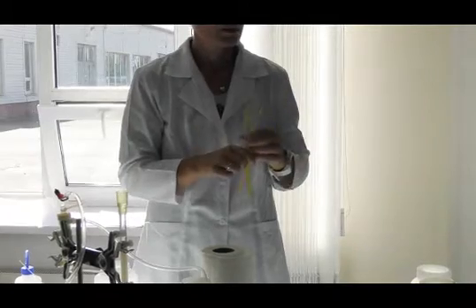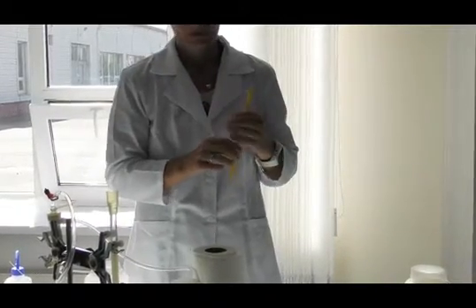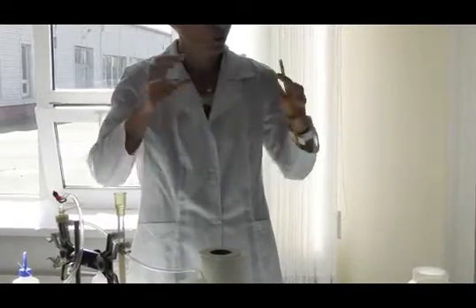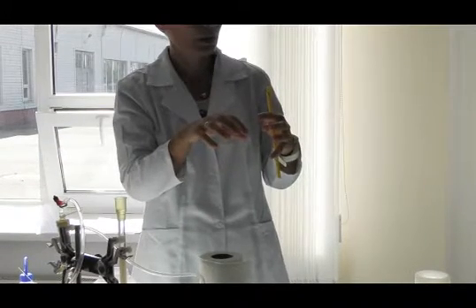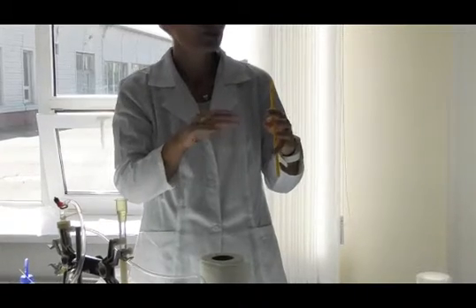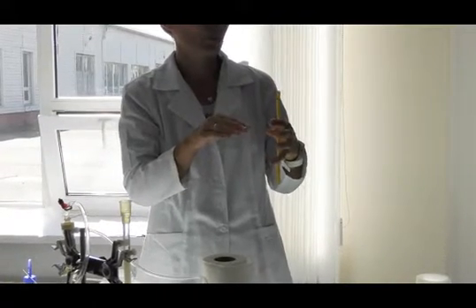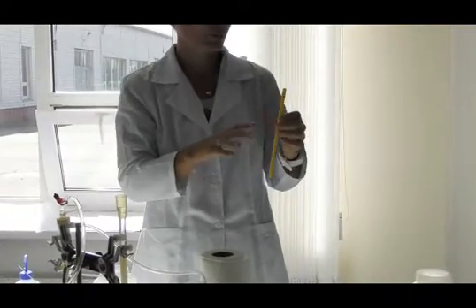So it's a very good system when it comes to clogging of the filter. That's a main difference from a filter where you press the whole sample through, where you will of course have clogging and filling in the pores, and then destroying the cutoff. In this system, you avoid most of that.